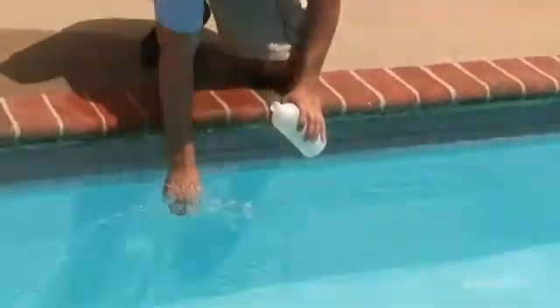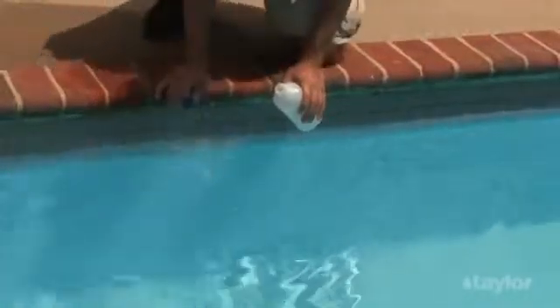Rinse both the bottle and the cap several times with the water to be tested.